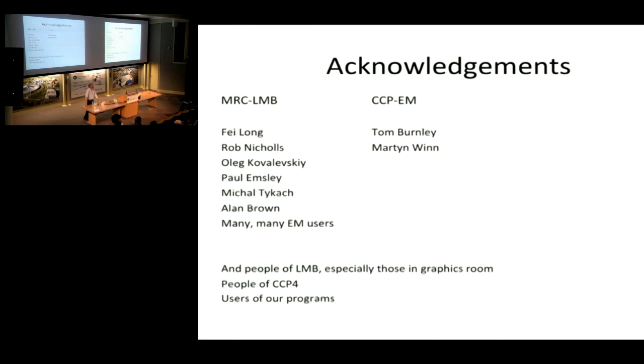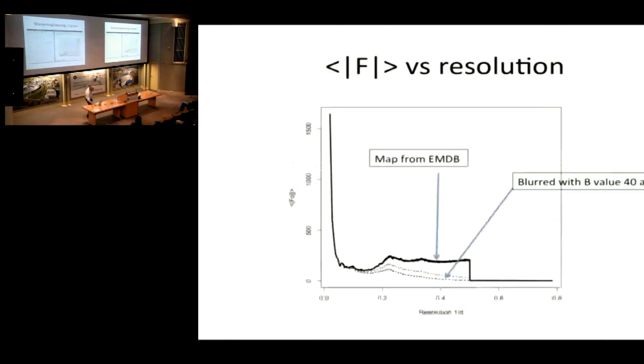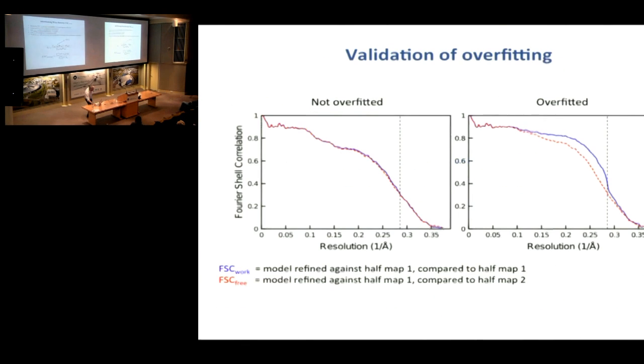Thanks. I've got a question about the test for over-refinement of the model. You showed a slide where on the left-hand side we saw two curves that were completely overlapping, and on the right-hand side they weren't, which was a sign of overfitting. I was wondering if there's a case in between, which is not as clear. Is there one value that we could come up with that would give a more objective estimate of how much overfitting there is?